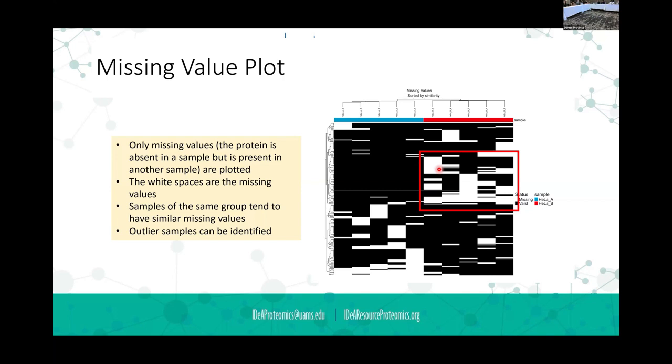Does that mean that it is not detected in the mass spec, or it is not seen in the sample at all? I would say that what we would say is that it wasn't detected. We cannot with 100% confidence say that that protein is not there. We can just say we just didn't detect it.